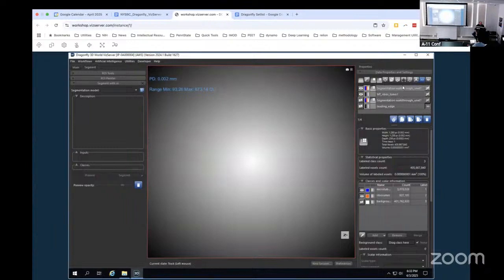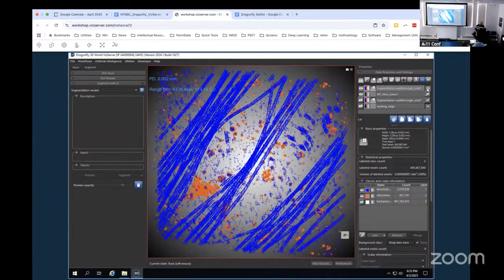And then next to your segment, in the properties tab, there's this 3D button right there. You can tell it to open in 3D. Wow. This will give you a sense of how much noise it's picking up. It's definitely not perfect. You see all of these little points in here, but that's pretty easy to remove.